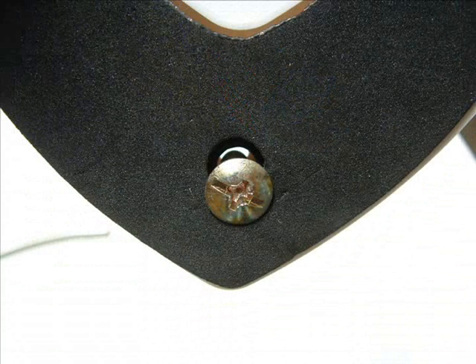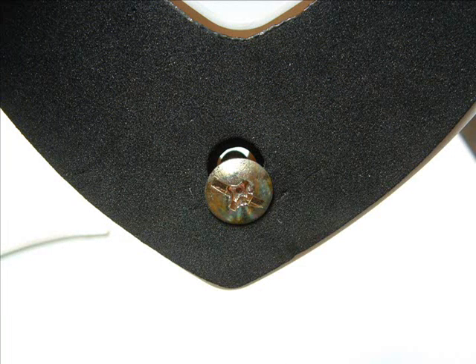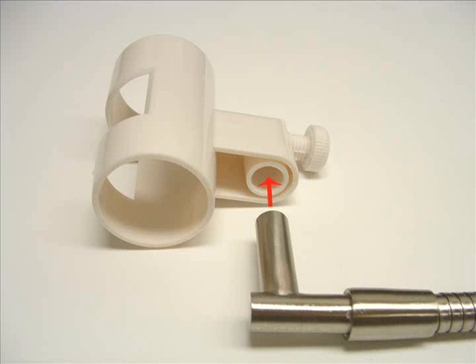Once connected, screw the two pieces together by screwing in the screw from the bottom of the base. Then on the other side of the stand, insert the holster.